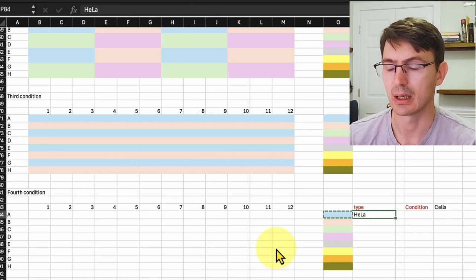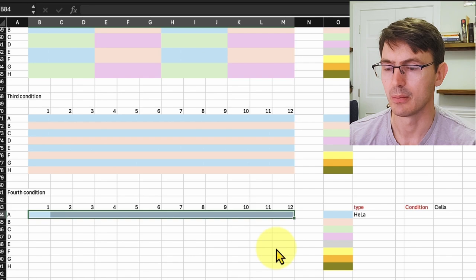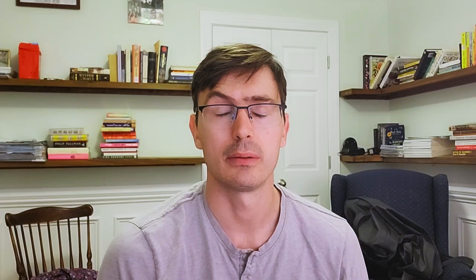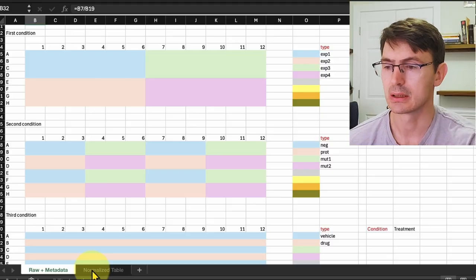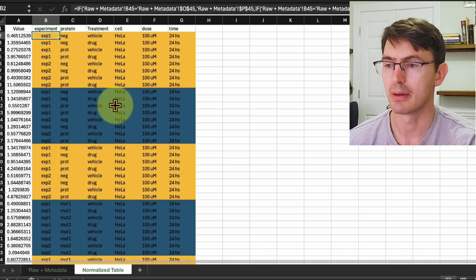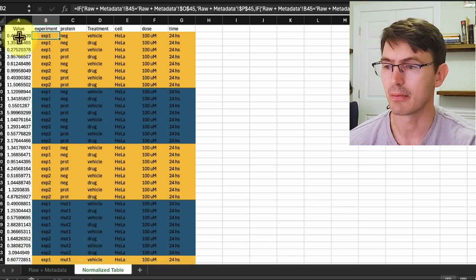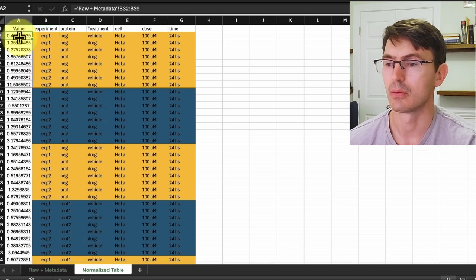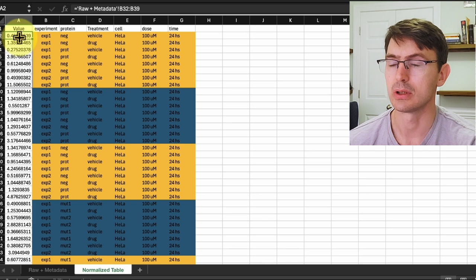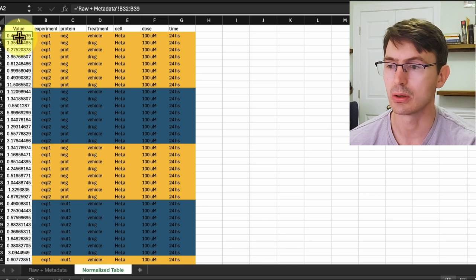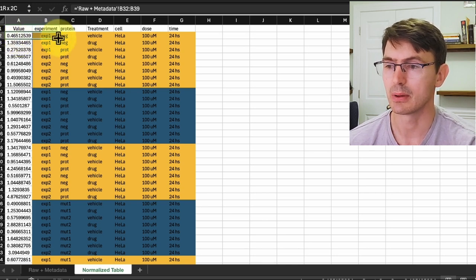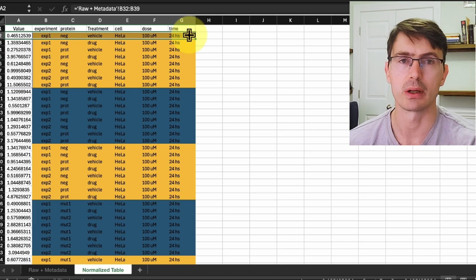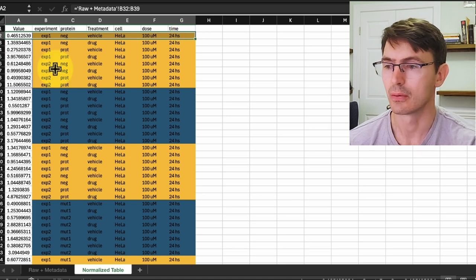So far so good. Now let me show you how to put everything together in one table. So in this second sheet we have such a table where we have the Renilla and luciferase ratio here at the beginning for each sample, followed by each of the conditions for this well.